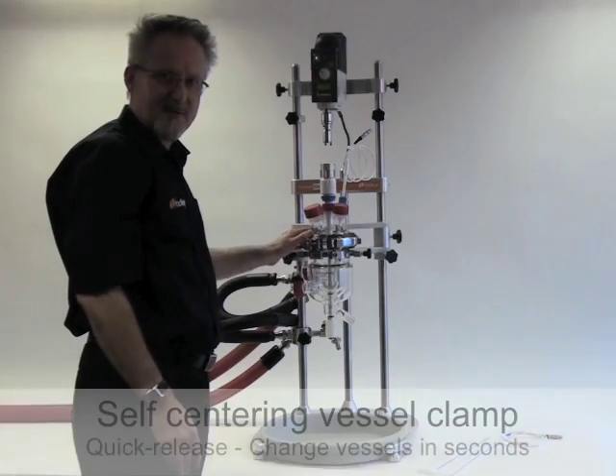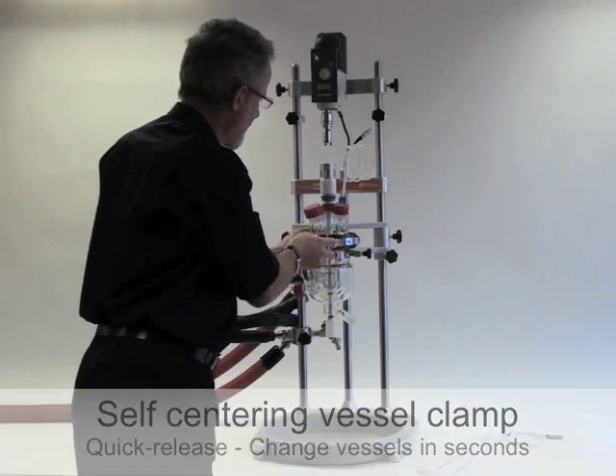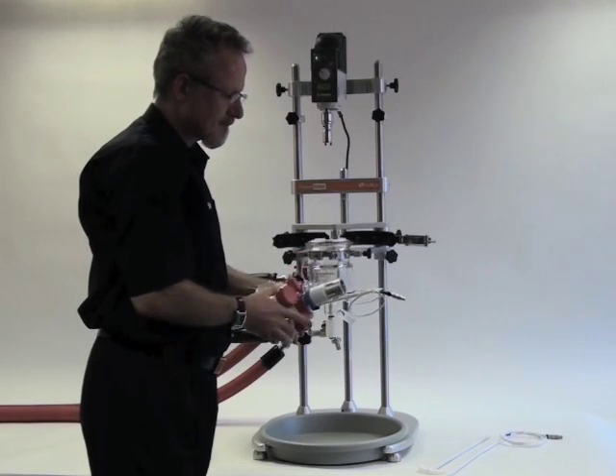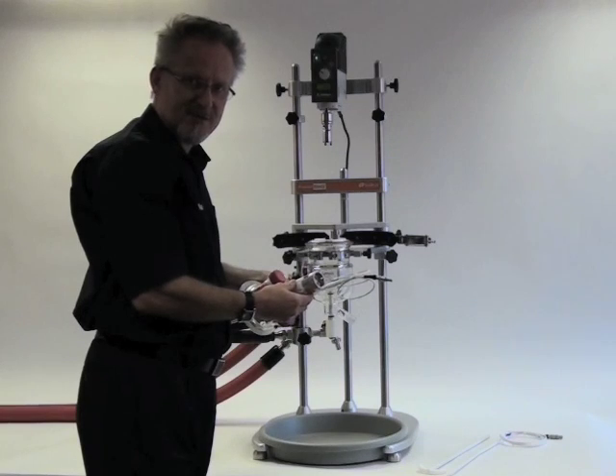Now I can undo the vessel quick-release clamp and remove the lid. This is the PTFE stirrer guide which provides a rotating seal on the stirrer shaft.